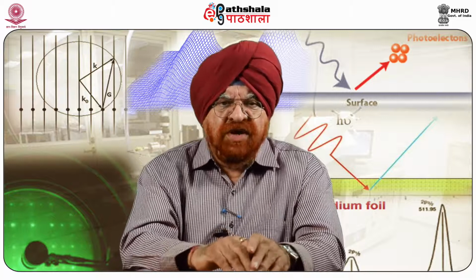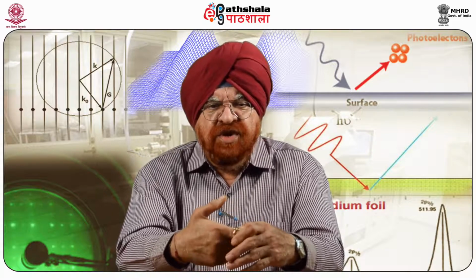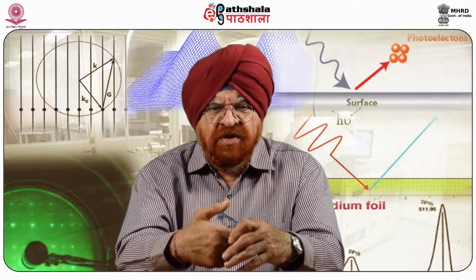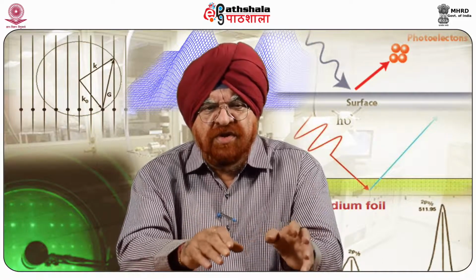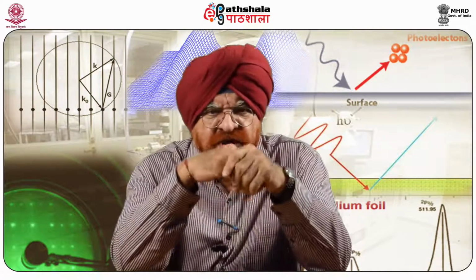Also, in order to confirm that the MFM signal is mainly of magnetic nature, this is what was confirmed by Porthun et al. in 1998, the measurements were carried out at a fixed tip to sample, that is substrate plus film, distance d in the 100 to 2500 nanometer range.